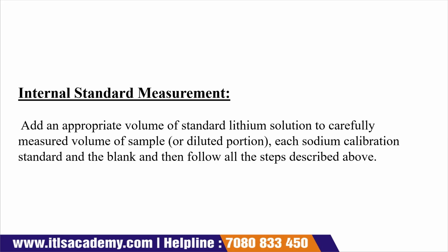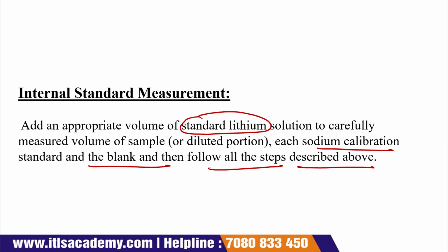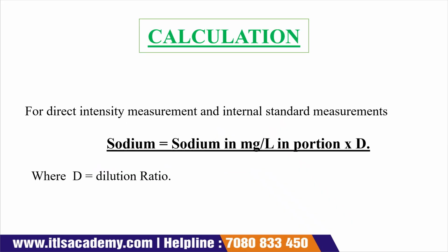For this, we add an appropriate amount of standard lithium solution to the carefully measured volume of sample, each sodium calibration standard and the blank, and then follow all the steps described above that we already discussed.